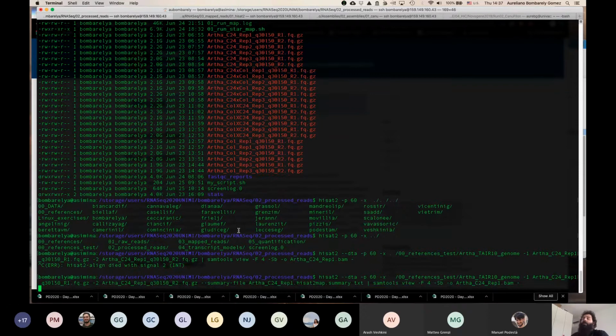Okay, so now I'm running the program, and it will take, I don't know, maybe 30 minutes, well, 10 minutes or something like that.